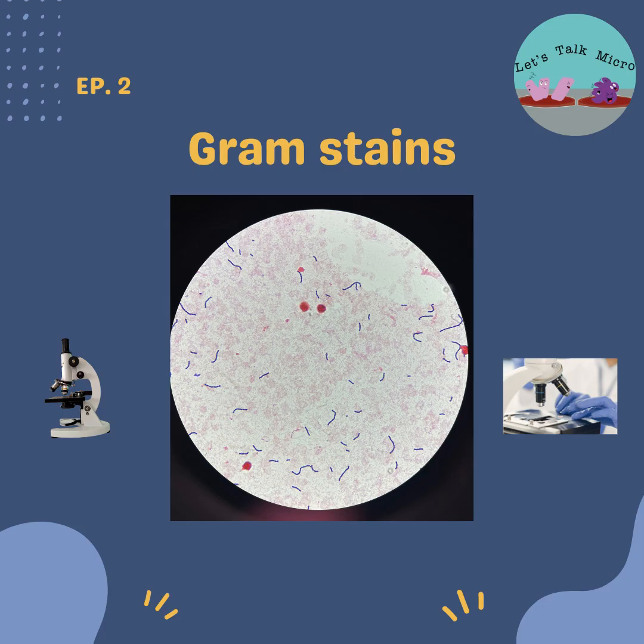Well, here's where I reference some of the textbooks. Just to put it in some nice words, it's the principal stain used for the microscopic examination of bacteria. It is one of the most important techniques in the microbiology lab, and you cannot believe how important it is. It saves time, it saves you from getting into trouble. If you're a medical technologist in micro, you know this. If you're a student, just listen to this.